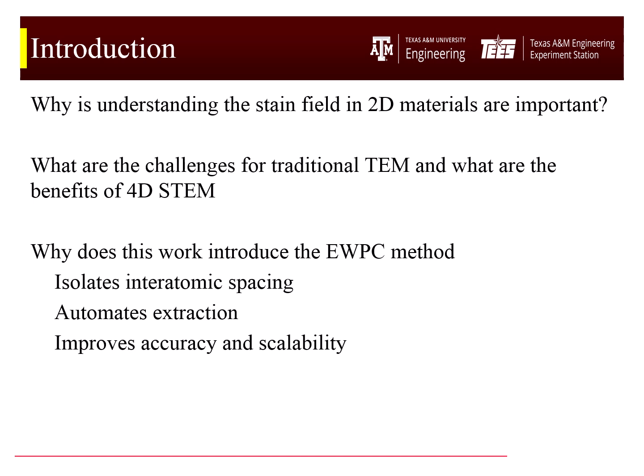However, even 4D-STEM has its limits. Mapping strain in complex structures like twisted bilayers or nanohedral structures is difficult because their small size and irregular geometry complicate analysis. To address these challenges, this work incorporates machine learning technique into the workflow. Specifically, this work used a deep learning-based approach to assist in identifying and analyzing strain pattern automatically and accurately.